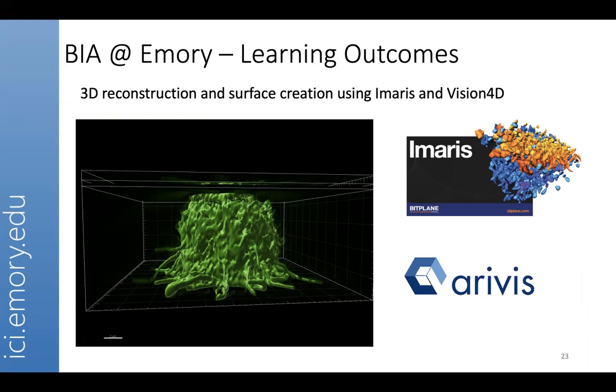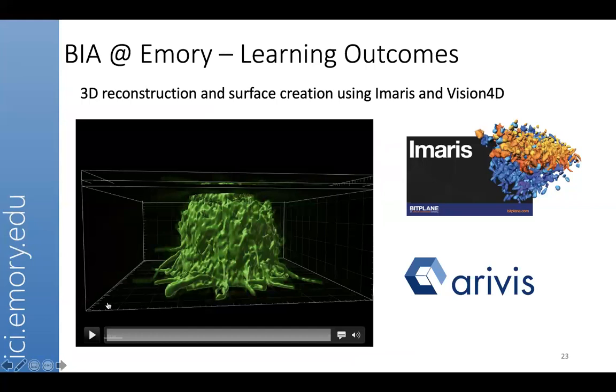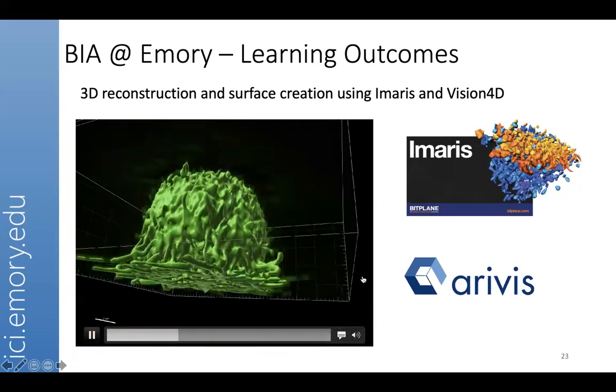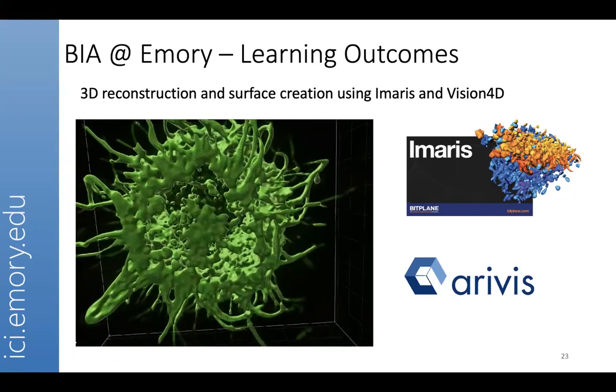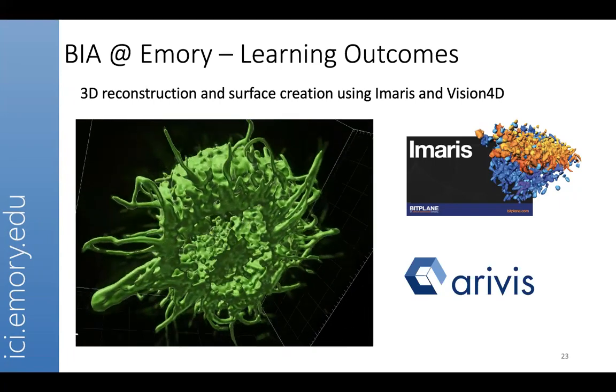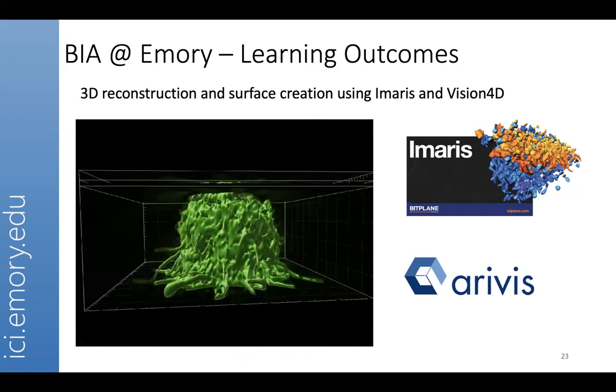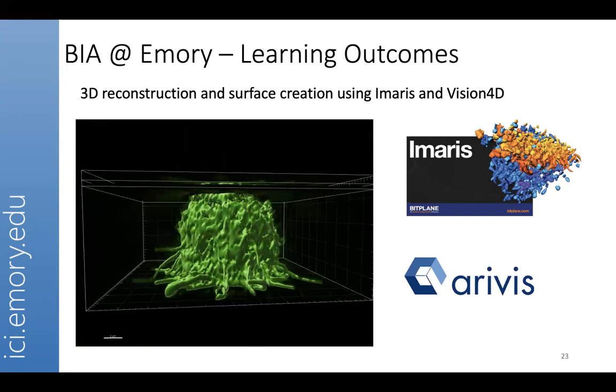These are the tools which are part of the workstations on core. The reason why we will emphasize these tools is because they are really very easy to use, and they are really very powerful in terms of 3D reconstructions, giving you really awesome data. So when it comes to publishing papers, we strongly recommend you try and use some of these tools versus some of the freely available tools or plugins available in Fiji, okay?